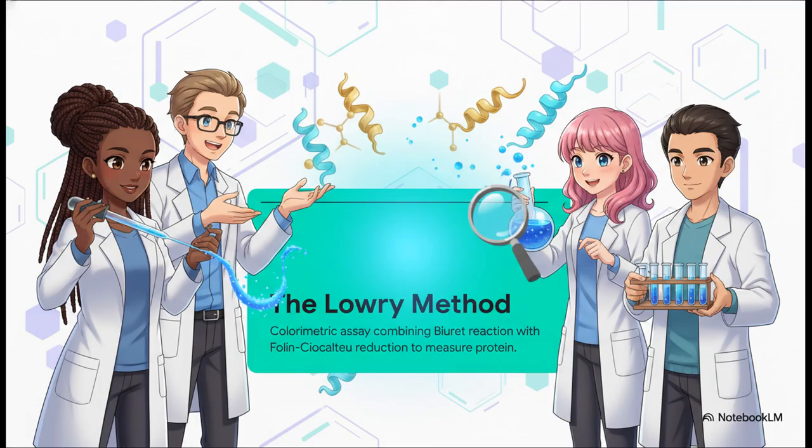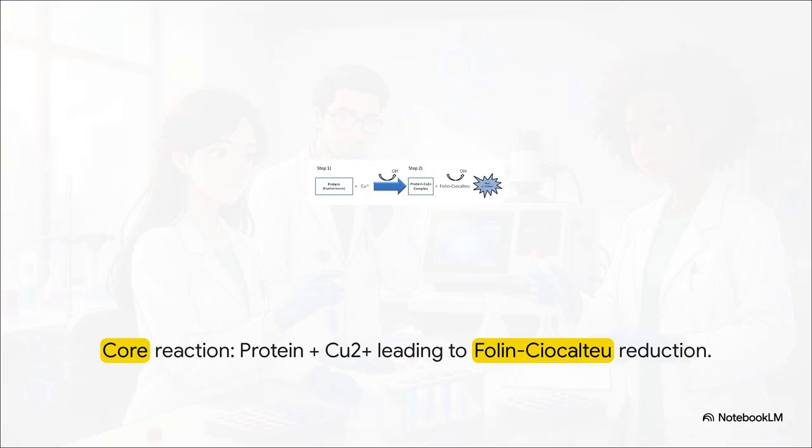By combining a classic copper reduction, which you probably know as the Biuret reaction, with the reduction of a really specific chemical called the Folin Ciocalteu reagent, this assay produces a super vivid blue color. It's incredibly sensitive too, actually capable of detecting protein concentrations as low as 5 to 10 micrograms per milliliter. No way you're eyeballing that without some chemical help. Now, let's think about exactly how that magic happens right in your test tube.